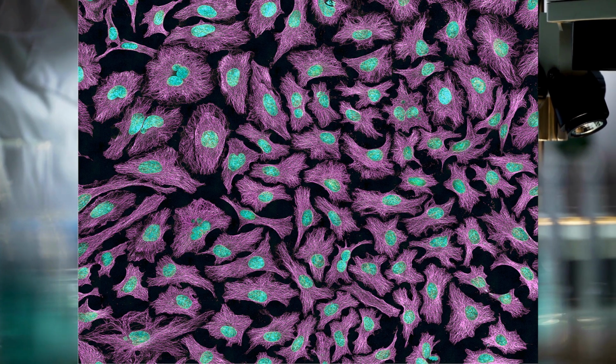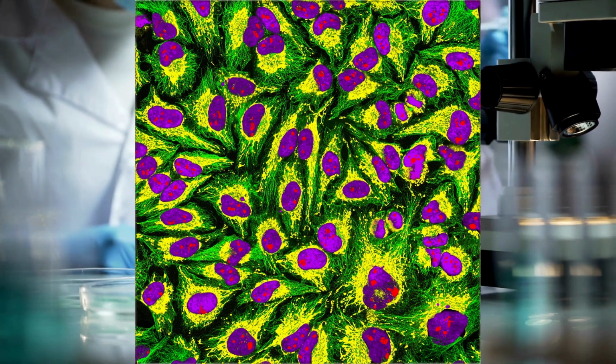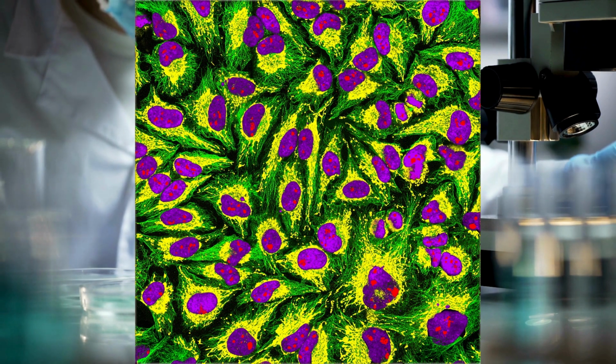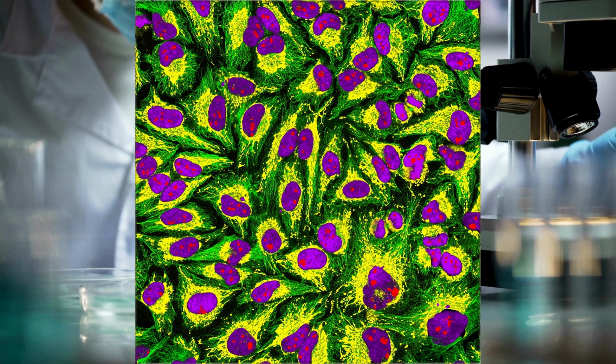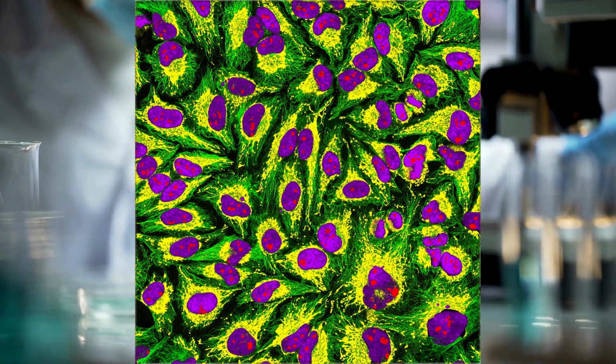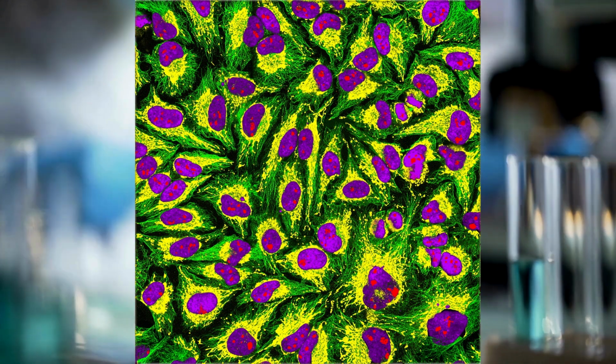There are of course ways around this, but the ways around this may not necessarily be useful in extrapolating out, as you're going to struggle to ensure that the sample you're looking at, particularly after the fluorescence process, is exactly how it should be. Other times, you basically have to accept that this is just one arm of an experiment, and you have to justify its reliability and context using other methods again.